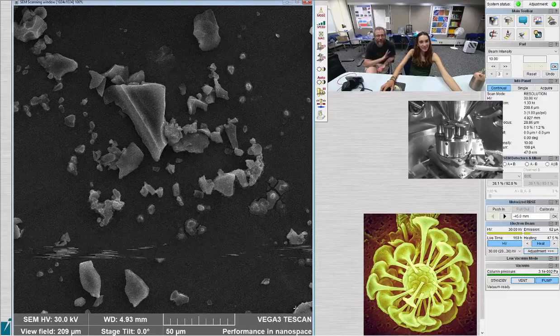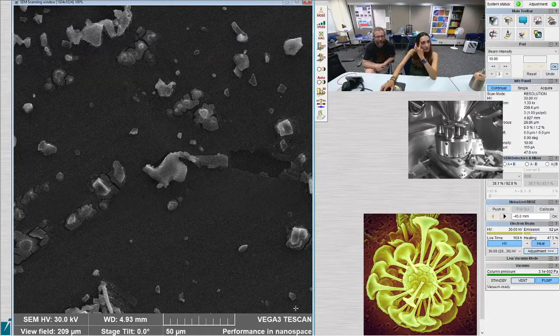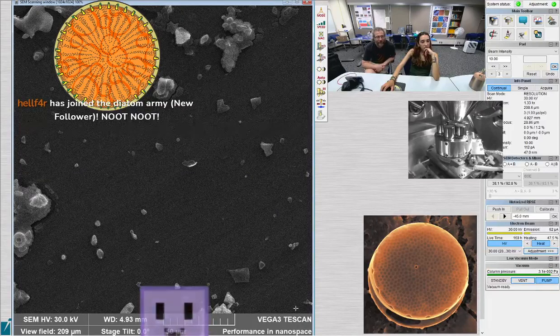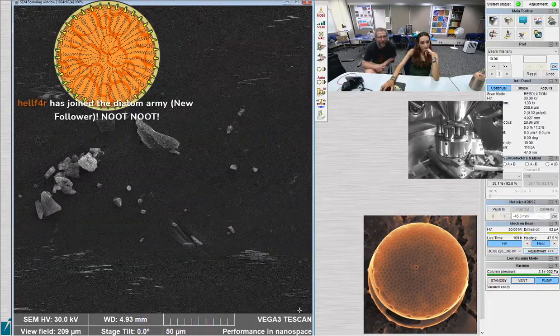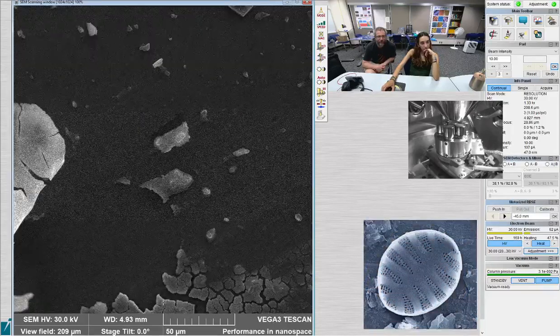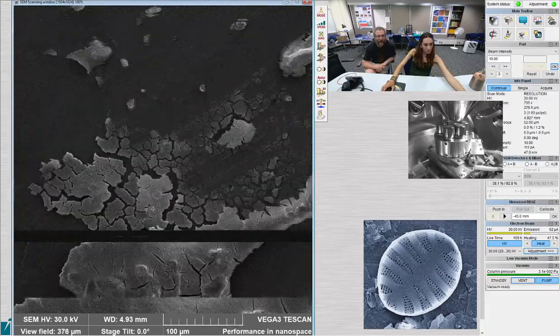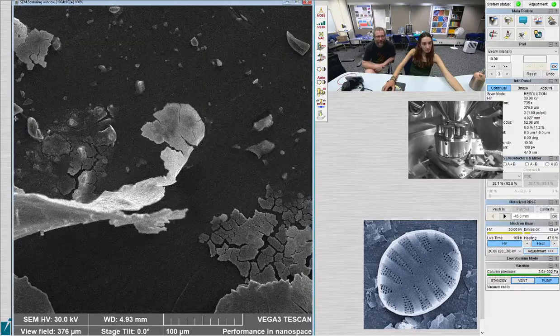So every stub on here, and there's seven in the carousel, is the same sample that we just prepped seven different times. Well, I prepped them. So they're all full of the same stuff. If we don't find what we're looking for on one, we can just move to the next. A little bit of crusty stuff in this one.